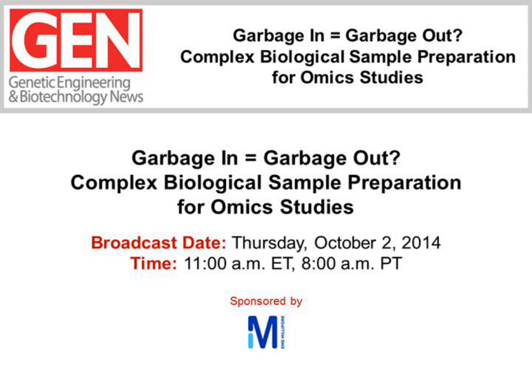Omics technologies can provide scientists with lots of useful information for any number of research projects involving new drug discovery, biomarker identification, forensics, and vaccine development, just to name a few. However, meaningful outcomes depend on careful sample preparation and analysis. Otherwise, the results just may reflect the process of garbage in, garbage out. Today's webinar has been designed to help you avoid going down this path. Our two panelists will discuss and demonstrate improved techniques for preparing and analyzing samples for proteomic and lipidomic studies.